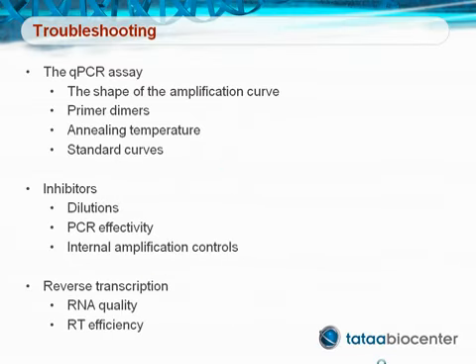During this webinar, I will talk about different problems that can occur during qPCR, how the problems can be identified and what to do to solve them. I will start talking about problems that can come up and be identified during the qPCR run. I will then talk about problems concerning inhibitors, and in the end about problems with the RNA and the reverse transcription step.